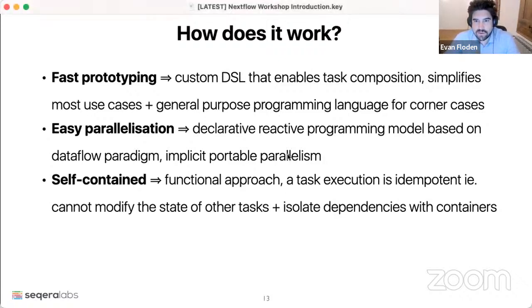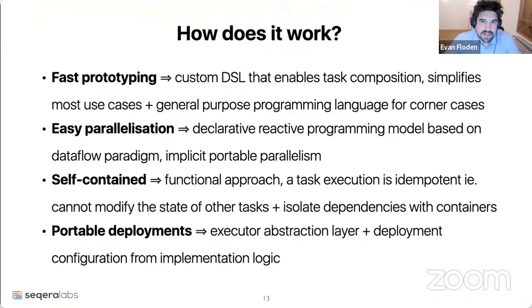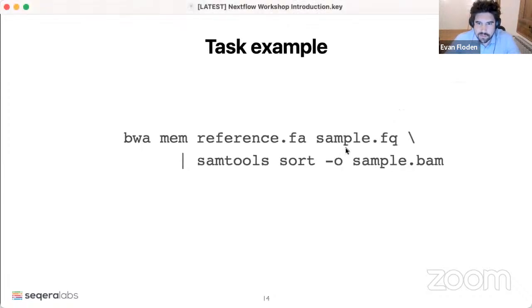But this has really led to many of the systems which have been built afterwards, things like AWS Batch and the managed services in the cloud, etc., which all fit this model very nicely. And finally, as I mentioned before, this concept of keeping the workflow definition separate from the execution, the configuration of where you run those pipelines as well.